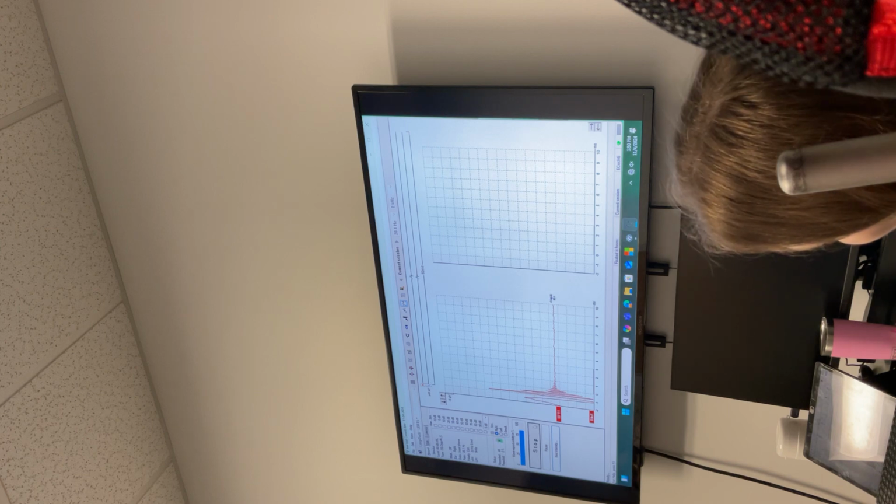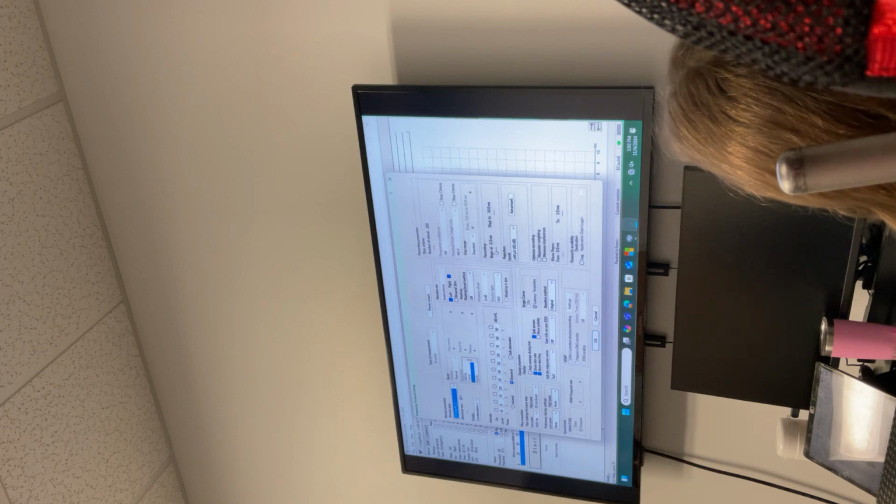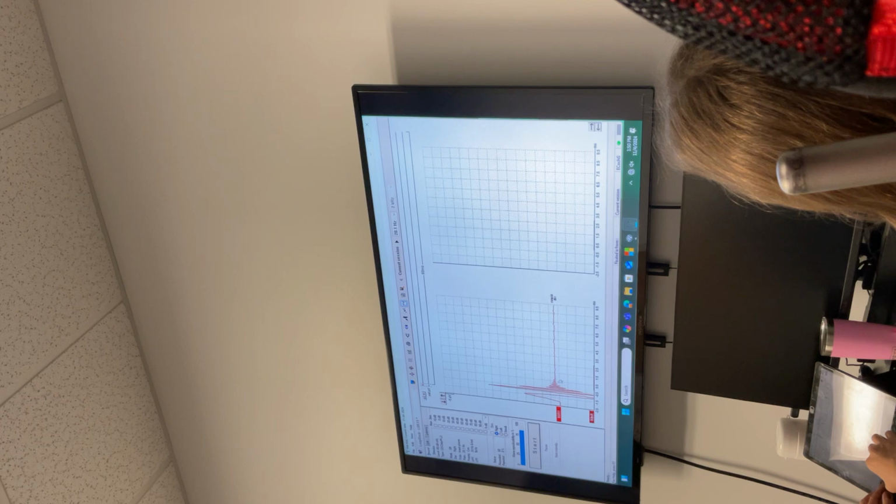So let me stop here. Setup. I think the Eclipse system should have allowed us to visualize even before minus 2.5. Okay, but that's not. Let me start over again. Start.